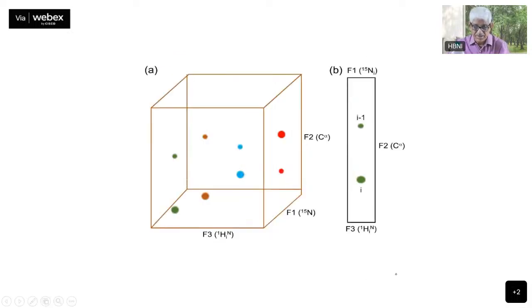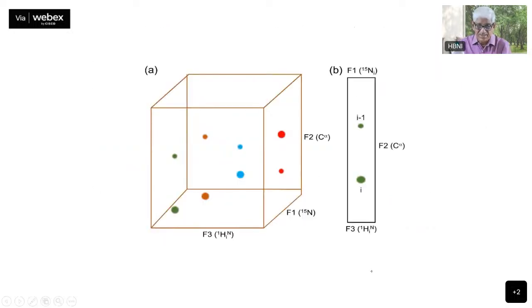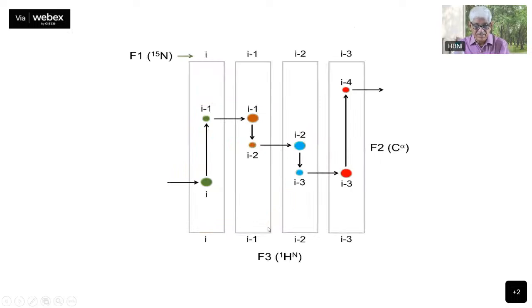This also shows up in these coefficients, these various coefficients which are present here, this one and this one. These are the coefficients which will actually dictate the intensities of the peaks. This dictates the intensity of the sequential peak, and this dictates the intensity of the self peak. So these will be slightly different, and you can see that in the spectrum as well. So you will see different spectra in this manner. Therefore, you can walk along the polypeptide chain rather easily without any difficulty at all.